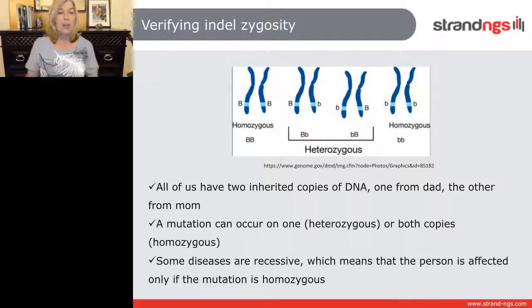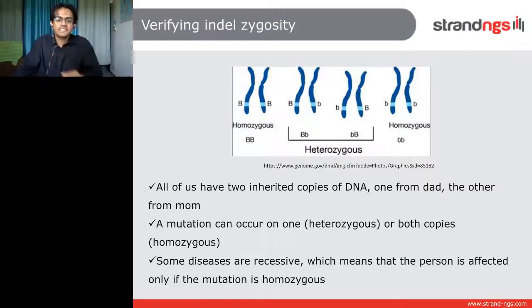It looks like we have time for one more question. Does Strand NGS Server support base quality recalibration? Yes, it does. Thank you for that question. In fact, you may have fleetingly seen it in a slide over here. You see that there's a stage called recalibrate base qualities. So yes, it does support recalibration.